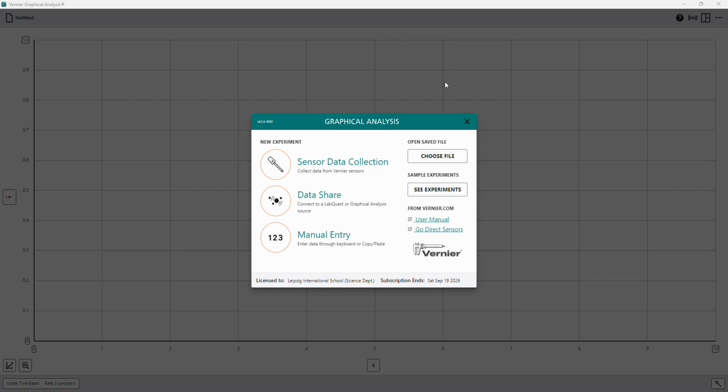Now, after you have acquired your data, you may do all your post-processing on any other device, any other program. It could be anything from Google Sheets to maybe Desmos to maybe a programming language that you've been learning, like Python, for instance.